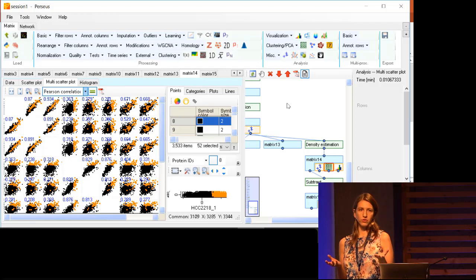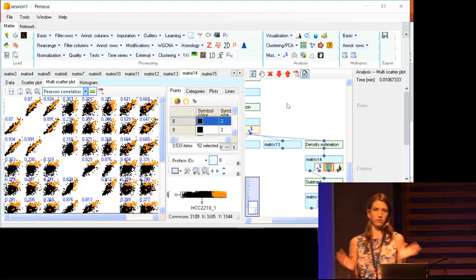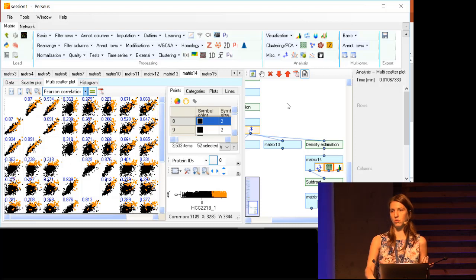Any of you can just go to the UniProt website and download these annotations, and not just for human, but for any organism that UniProt supports. All you need to do is download it from there and copy it into this conf annotation folder that Tommy showed you. And Perseus would find it and it would work. So you don't even need to wait for official releases. You can just download the files yourselves. Right.